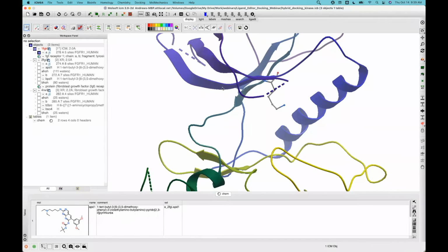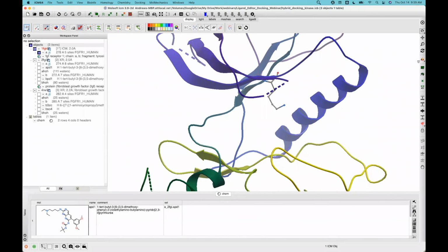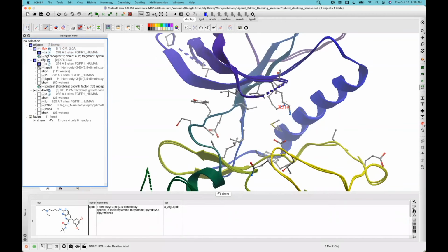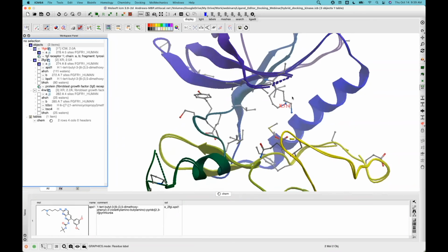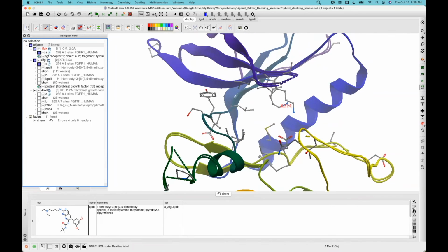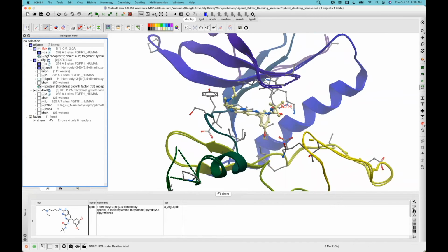So it's residue number lysine 514. So if we display the other, you can see the lysine here from when the inhibitor is bound, that lysine is shifted. So in the other structure it shifts out basically.